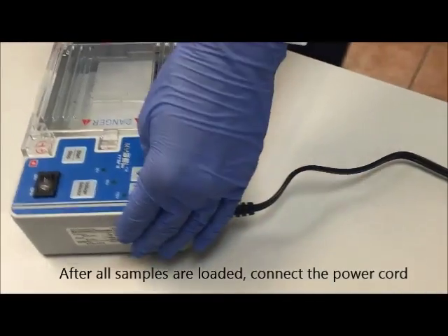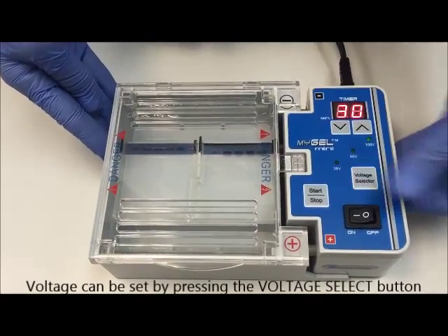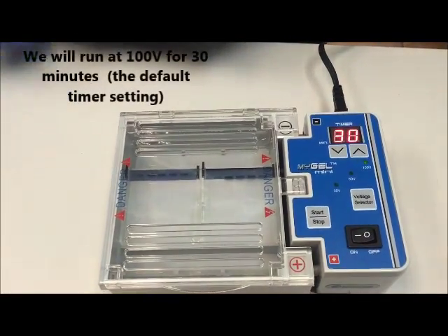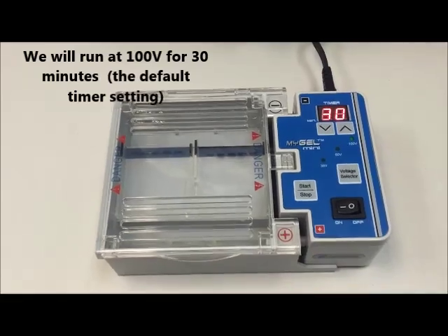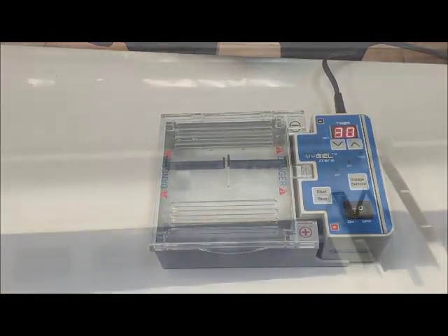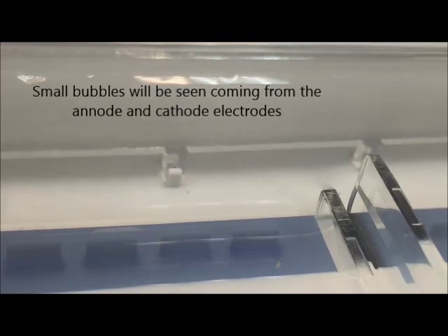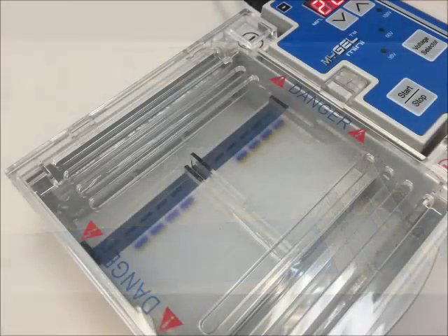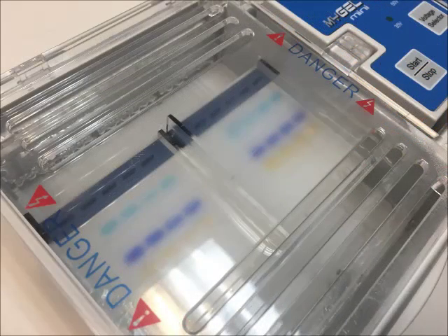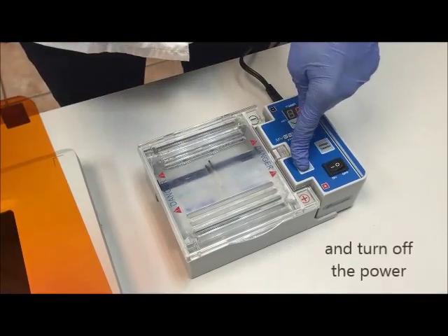Now pipette our samples into the gel wells. When the samples are loaded, connect the power cord to the back of the power supply and switch on the power. The voltage can be set by pressing the voltage select button on the MiGel power supply. We're going to run the gel at 100 volts for 30 minutes. When current is running through the buffer, small bubbles can be seen coming off the anode and cathode electrodes on either side of the gel tank, and you will see the dye front moving in front of your DNA. At the end of the run, press the start/stop button and turn off the electrical power.